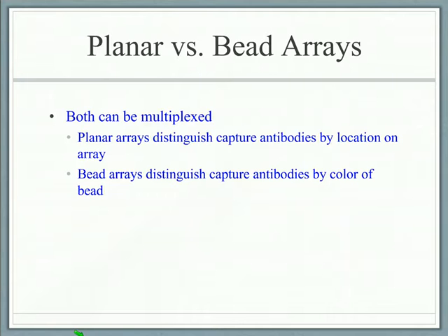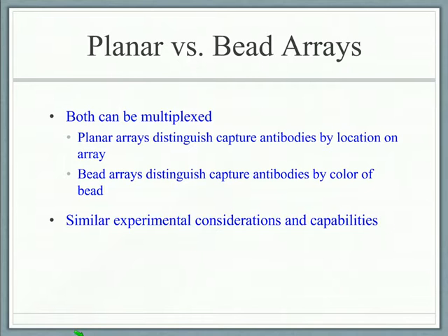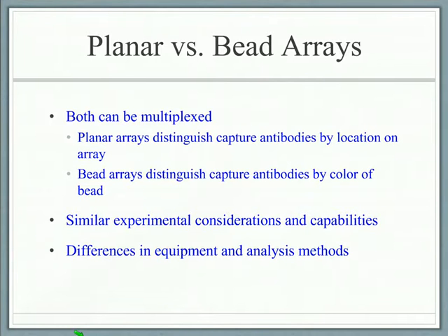The bead arrays use different colors of beads, and toward the end of my section I will describe how the bead arrays work. Just as the examples for what I want to talk about, the examples will be drawn from the planar arrays, but all of the considerations that I'm going to talk about would apply to both platforms. So they have similar experimental considerations and capabilities, although the instrumentation and analysis methods are different, and I think you'll hear a little bit about that from the next speaker.